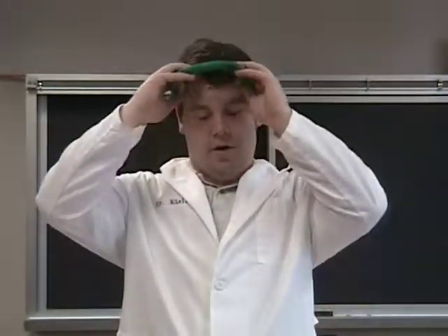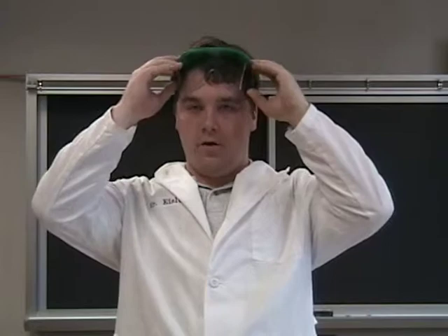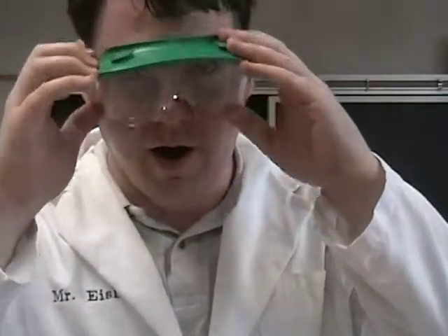Safety eyewear is meant to be worn over the eyes. If you wear them around your neck, your throat will be protected but your eyes won't. If you wear them above your eyes on your head, your bangs will be protected but your eyes won't. Wear your safety glasses over your eyes. Remember: hair grows back, eyes don't.